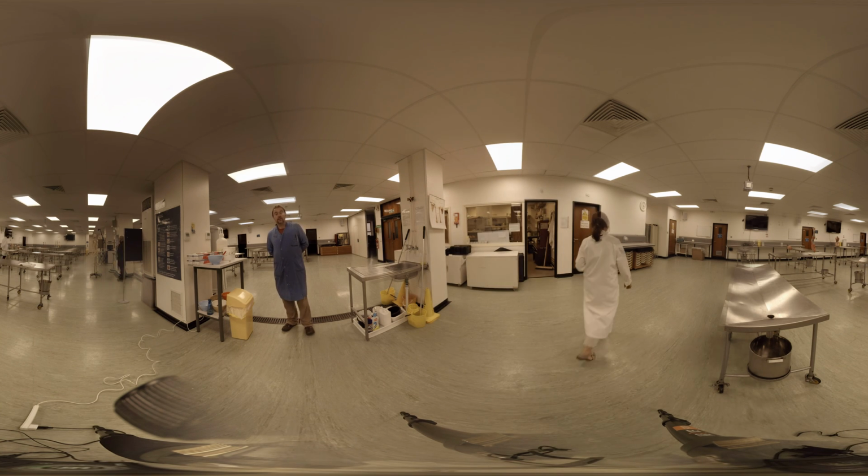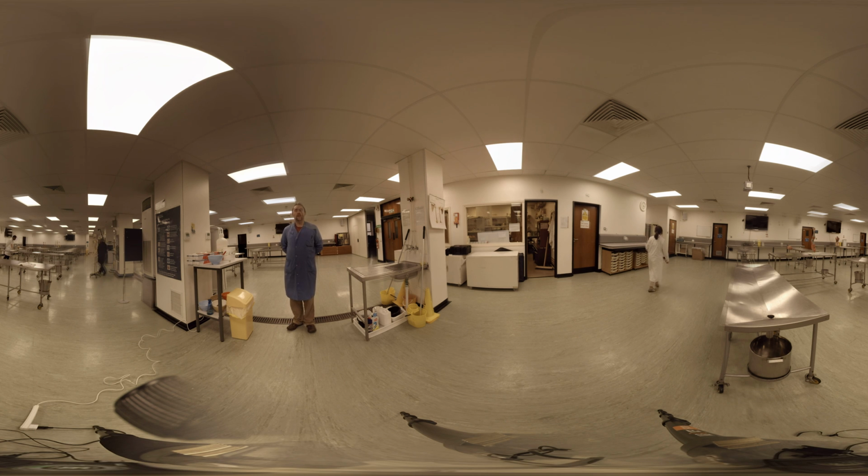At the beginning of each dissection class, you'll make sure that you're wearing your lab coat, you've got appropriate footwear on with hair tied back, and that you're also wearing your safety spectacles.